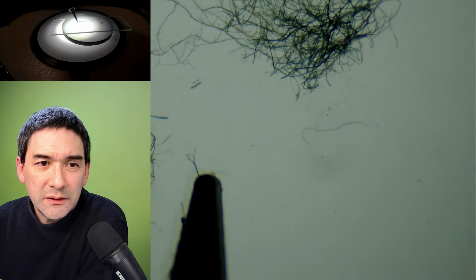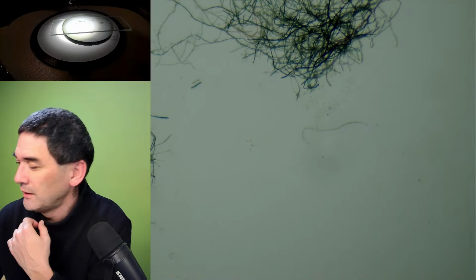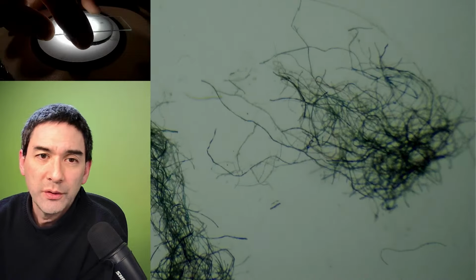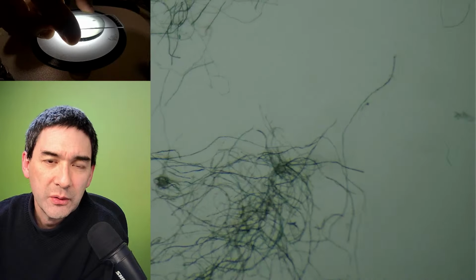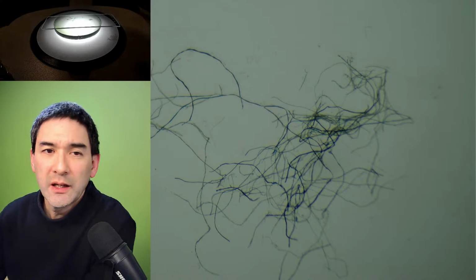Yeah. Okay, I think most of them over here do indeed appear to be non-synthetic. But let's have a look at some over here maybe. And so you can kind of play around.